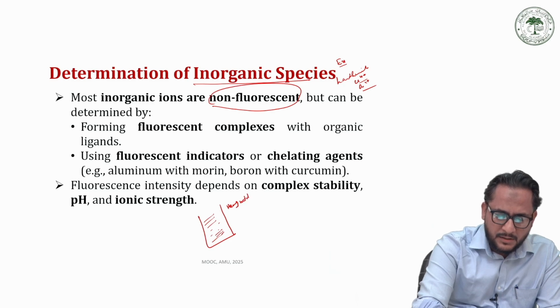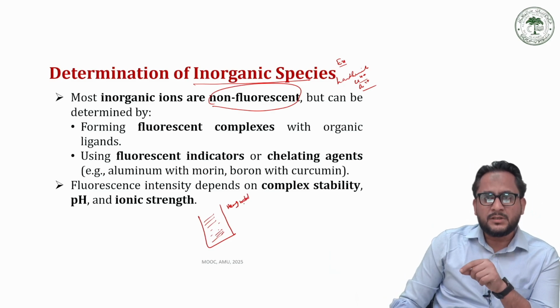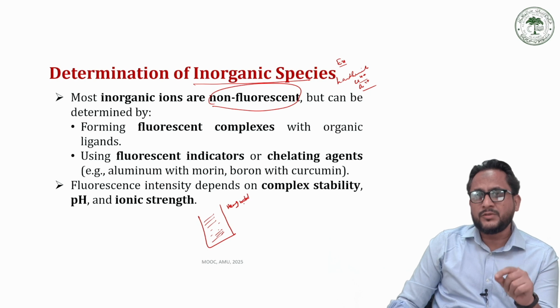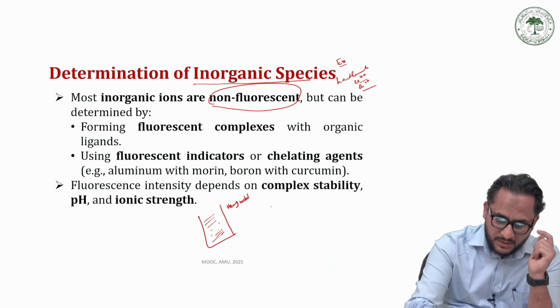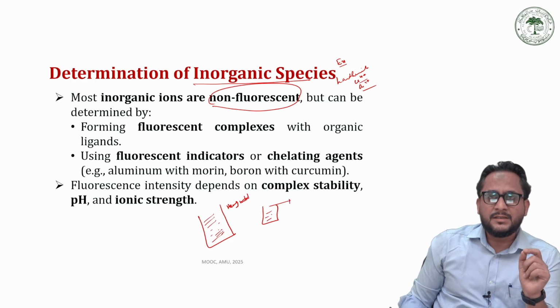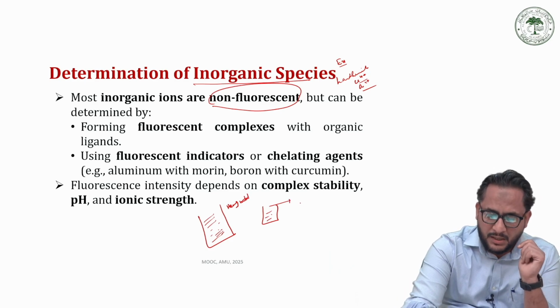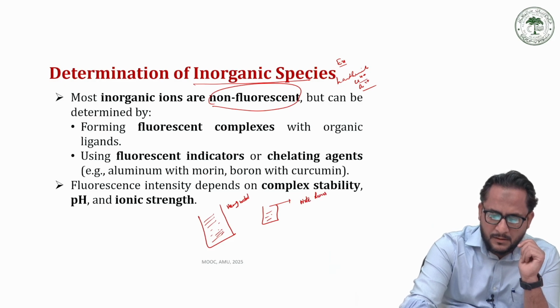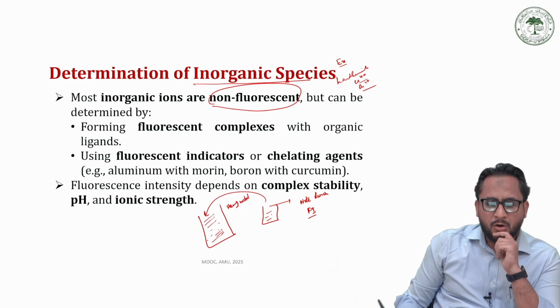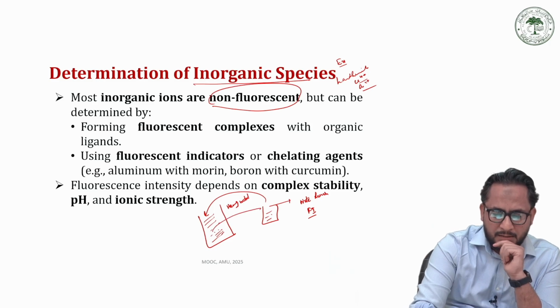Now, if heavy metals are there, they form complexes with fluorescent compounds, leading to quenching, a reduction in the PL or photoluminescence intensity of those fluorescent compounds. What we do is take the fluorescent compound in pure form, do the fluorescence intensity test using a spectrofluorometer and note down the fluorescence intensity.